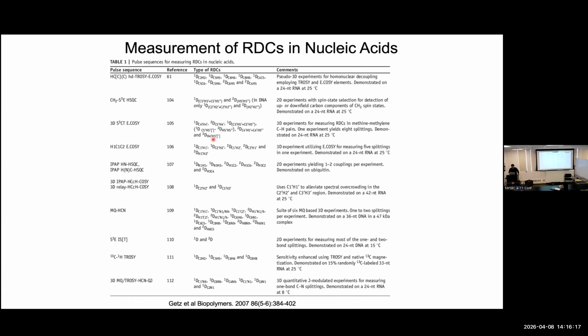Trigonometry. So I have chemical shift, which is, let's say, cosine omega t. But then I have the scalar coupling. How is that encoded? Cosine pi J t.